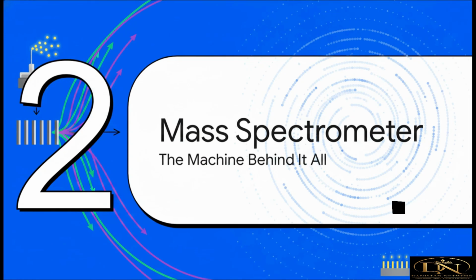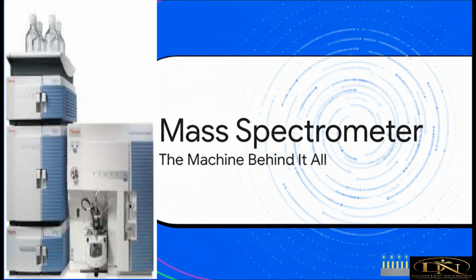Okay, but how do we get all this amazing data? I mean, how do we know the exact mass of each isotope and what percentage is floating around in nature? For that, we need a very special, very cool piece of equipment. So let's go inside the incredible machine that makes all of this possible, the Mass Spectrometer.